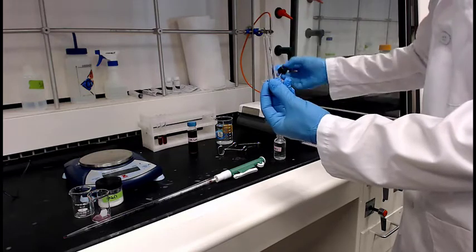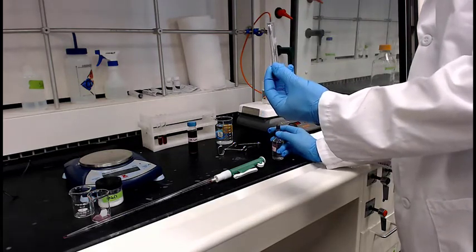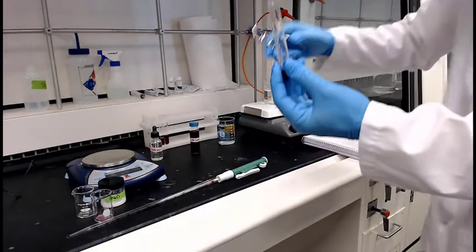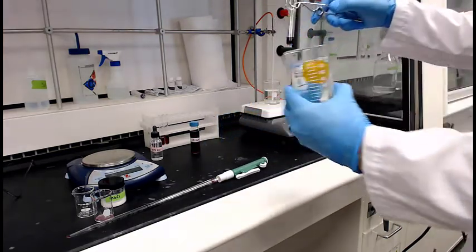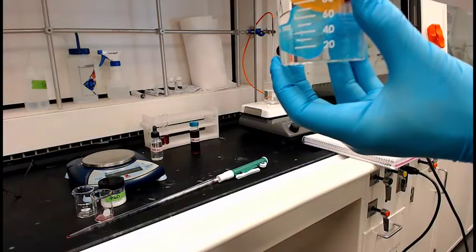Now that little pipette, that's never been anywhere except in the HCl bottle, so that's okay. Do a mix of that. So that's 4 drops of concentrated HCl. Now look at this. Look at the color. Now he's going to drop it into the cold ice bath.